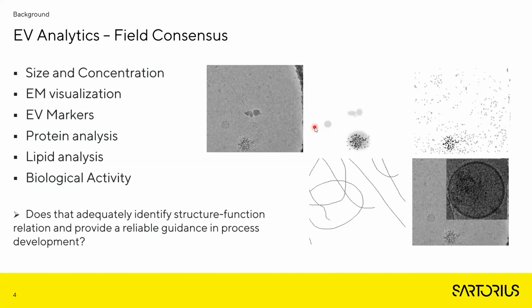It is a little bit like playing Guess Who. We pose the question and get feedback from the analysis. So we need to ask, are they particles? Yes, there are particles. They are approximately this and this size. Are there proteins? Yes, there are proteins. Are there nucleic acids? Yes, there are nucleic acids.